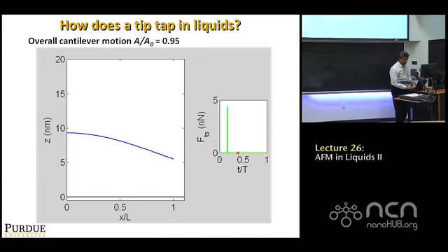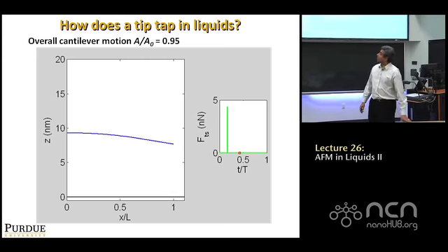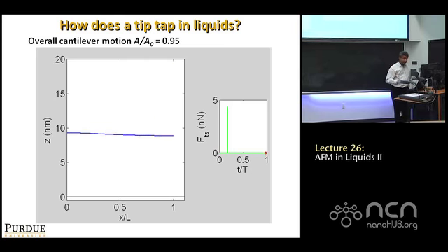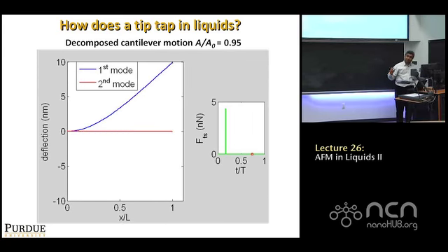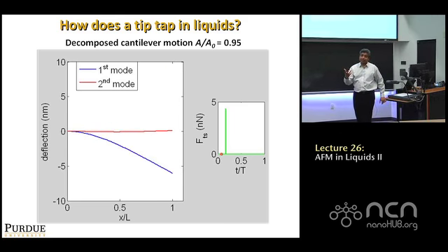So to understand a little better in simulation what really is happening, and this is what explains even Putman's results, as you're tapping on the sample, what is happening is the cantilever goes up, swings, and as it hits, you see there's a little distortion that occurs because locally you're making the second eigenmode ring. A good way to look at it is to divide it up into what the first and second eigenmode is doing. And with VEDA, you can do VEDA data and actually back out these kind of shape motions. But basically what is happening is the blue is the first eigenmode motion. As it oscillates, it's going up and down, and you see each time it happens, the second eigenmode rings. It's like a separate internal degree of freedom.